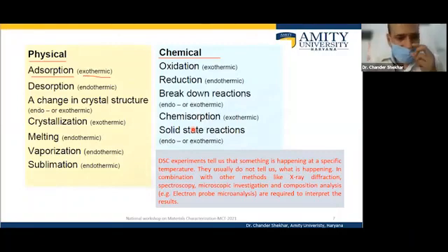That creates a difference in the sample temperature with respect to the temperature of the furnace, and this temperature difference is used to generate the information which is proportional to the event occurring in the sample.